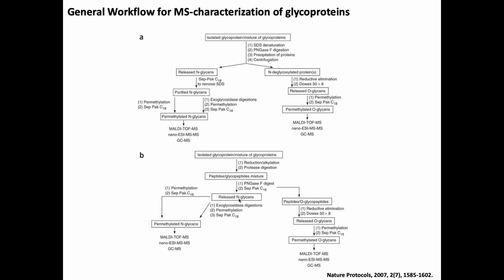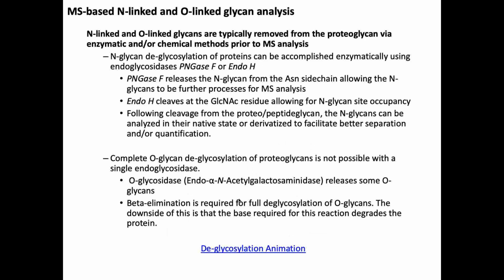So all these different workflows, and in every step, there is the opportunity to introduce pre-analytical variability, introduce artifacts, things that are going into the carbohydrates that are not real. And so all of it collectively is getting shrunk constantly. And the less you have to do with your sample, the happier you end up being.